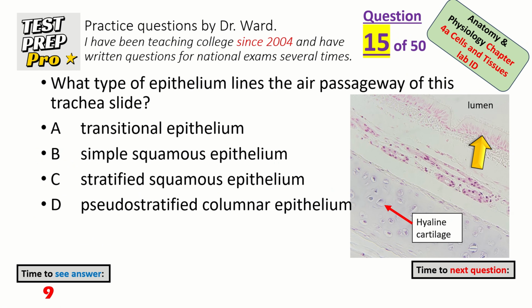What type of epithelium lines the air passageway in this trachea slide? Pseudostratified columnar epithelium.